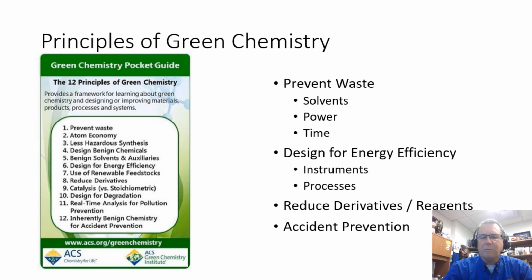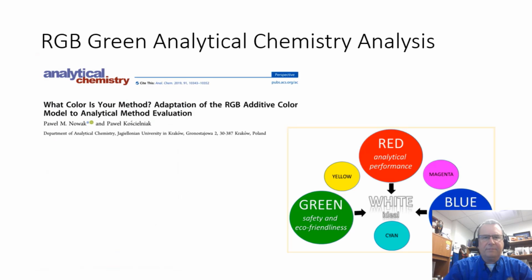But we think about our whole process. What about reducing amounts of reagents and derivatives that we use? And we're always, of course, thinking about safety and accident prevention. How do we keep everything safe?